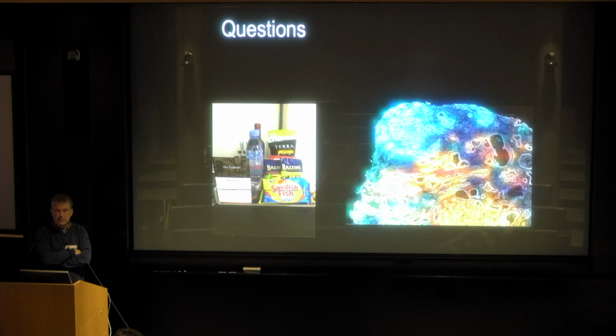Yeah, so that's a good question. The proteomics, they can only look for a short fraction of all the proteins present. It's not highly multiplex, so you could look into 30 or 50 or so proteins at the same time. And there are tricks around that in terms of fluorescence and in terms of antibodies that you use and stuff like that. However, I would say that we've done single cell in collaboration with Australia.